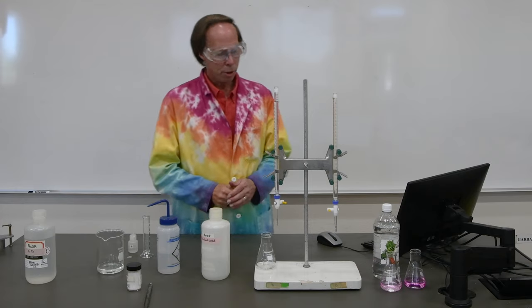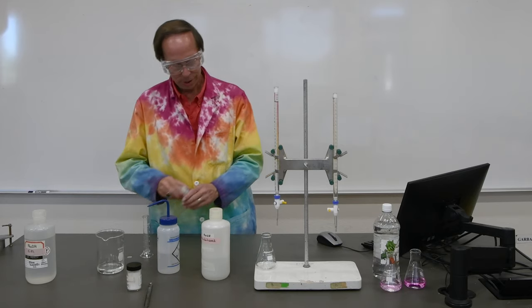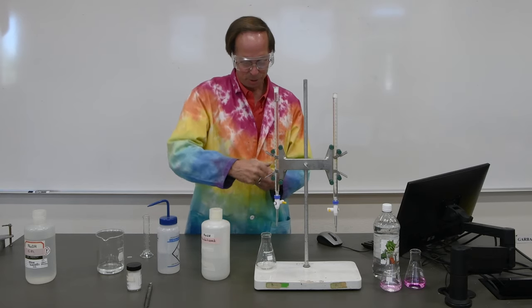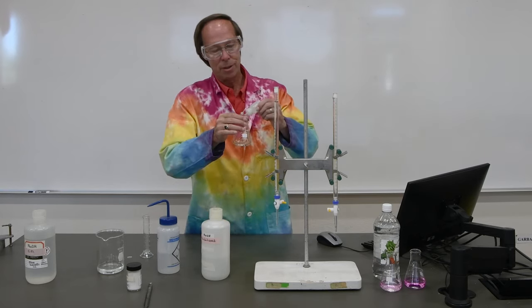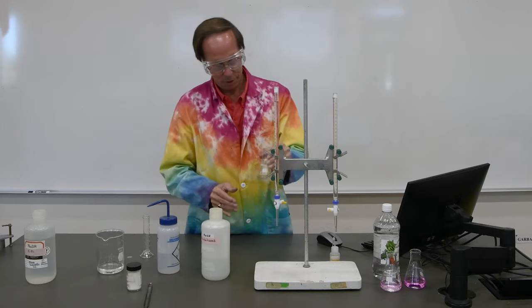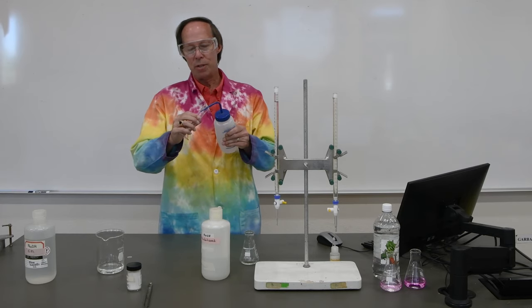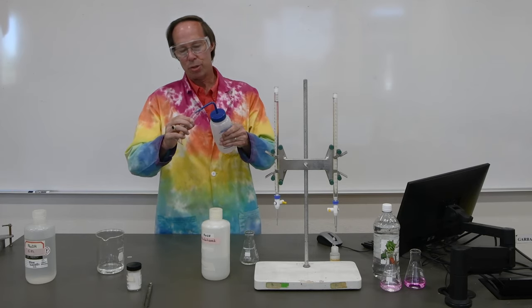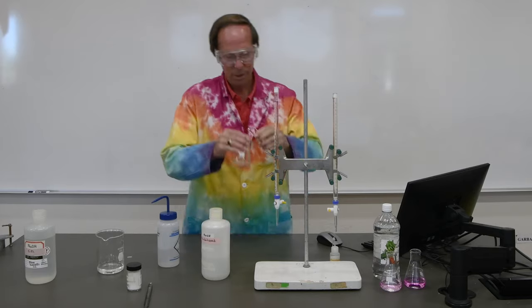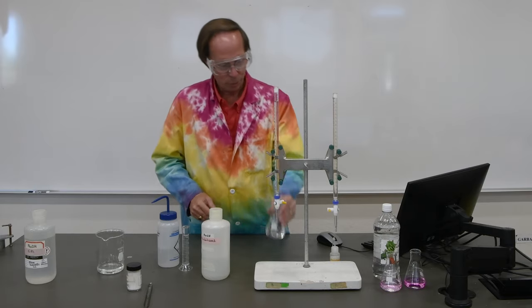I went ahead and prepared the third sample, so I added another 5 milliliters of vinegar to our third flask, and I refilled the burette with sodium hydroxide right back to the zero mark again to make our calculations easier. So let's add our drops of phenolphthalein here. And we'll swirl that around. Let's also go ahead and add that extra 25 milliliters of deionized water. It does make it much easier to see the color when the change occurs. There we go. That's enough sample to make it easier for us to see what's going on.